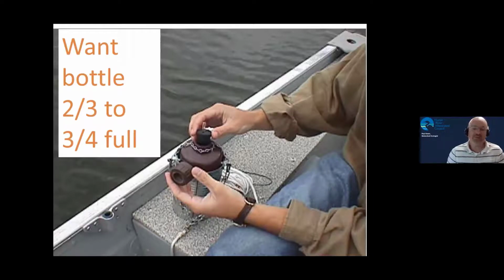If it's completely full, the problem is you may have been going too slow when you were pulling it up and you gave too much time for it to fill up at a lower depth. And the problem with that is that then you don't know if you were really sampling over that whole depth. You may have collected the water entirely on the bottom, and you don't even have any water from the surface that made it into the jar.